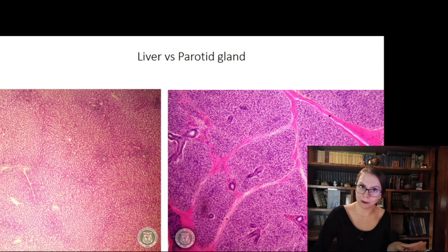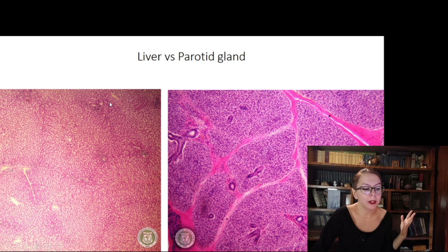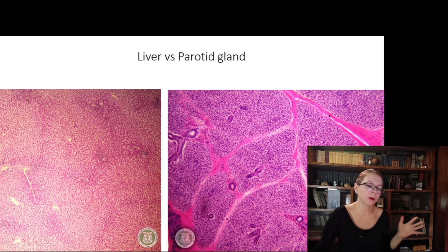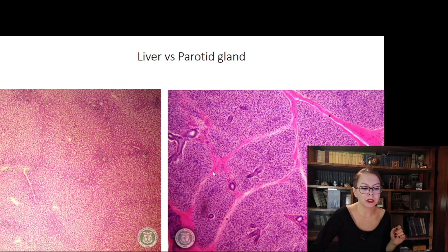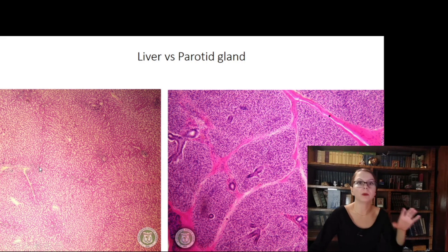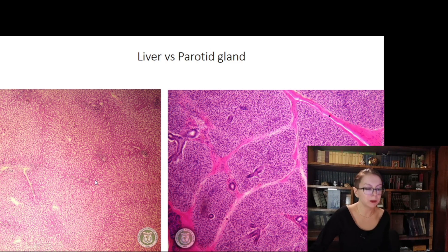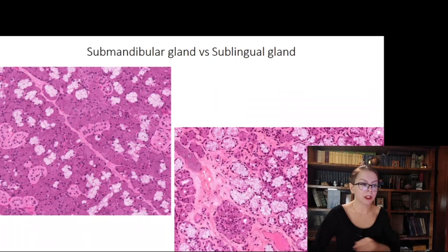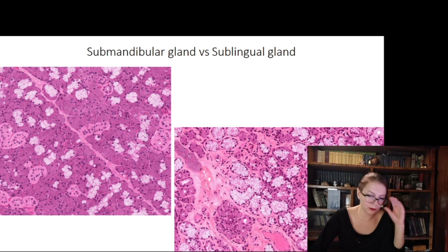Liver and parotid gland — these two specimens should not be easily confused. In the liver, central veins or portal triads might occasionally be confused with striated ducts, but striated ducts are much more prominent and more intensely stained. Also notice that in the parotid gland connective tissue is very well developed, while in the human liver the lobules are not separated from one another by connective tissue.